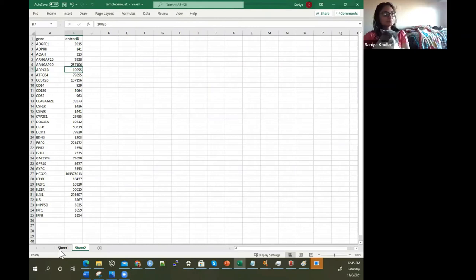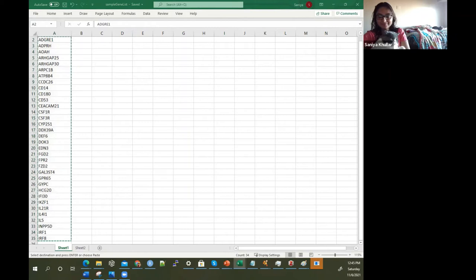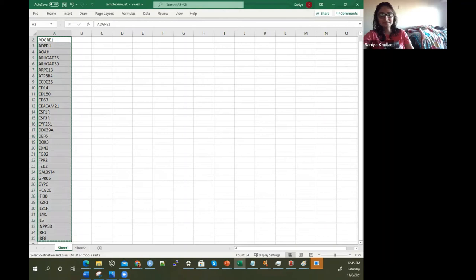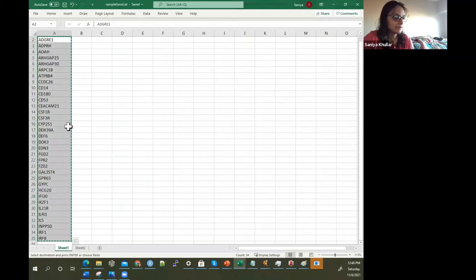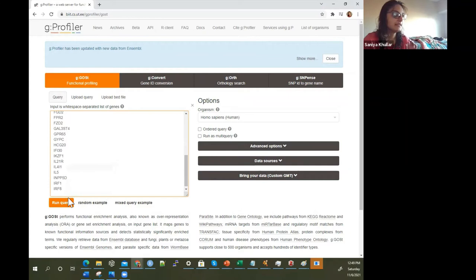Let's take this example here. We can just select all these genes. We can select these genes and copy them. Then the next thing is to paste them into G profiler as a separated list of genes. Then I'm going to run the query.